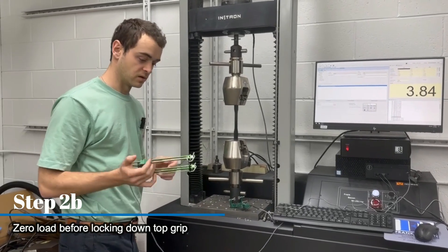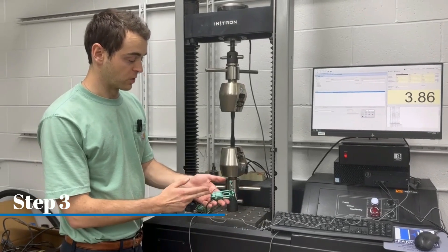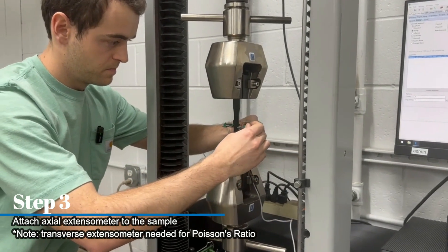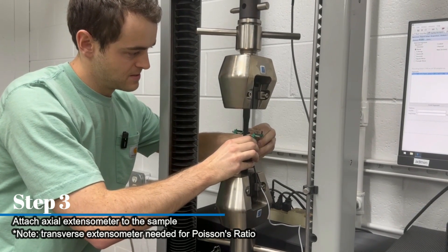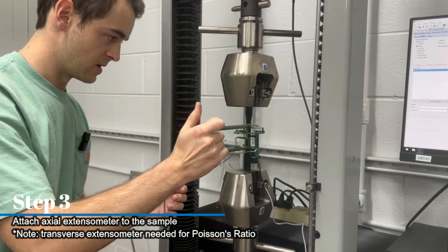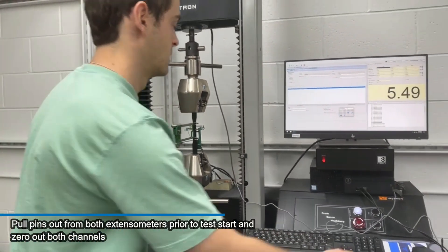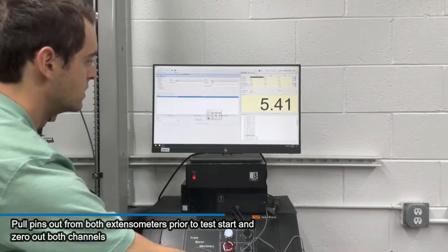Now we can go ahead and put our extensometers on. This is your axial extensometer, which you'll need per the ASTM. We also have a transverse extensometer, which is required for this customer's testing because you'll need it for your Poisson's ratio. Starting with the transverse — pull the pin out, and you can see that's locked onto the sample. Then put the axial over that, pull the pins on both, and zero out both channels. We're good to run a test now.